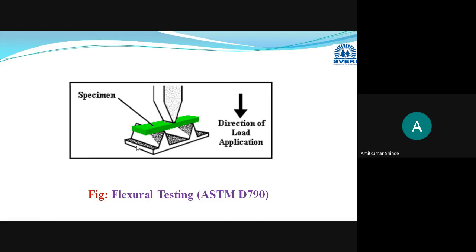Okay, I have written the name in the bracket, and remember that this particular ASTM standard D790 will be used for plastic materials. ASTM stands for, can you put the long form for that?